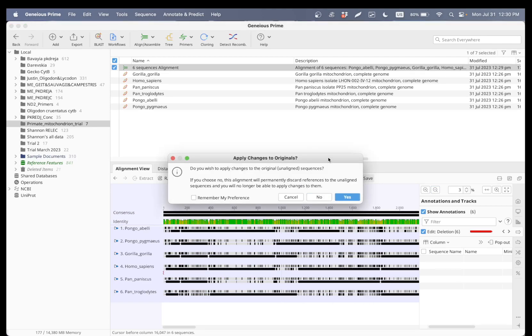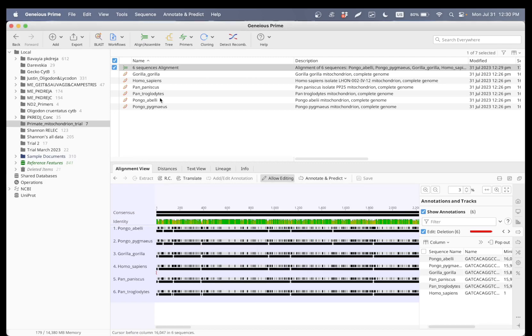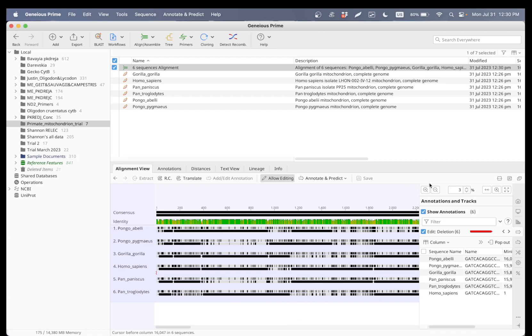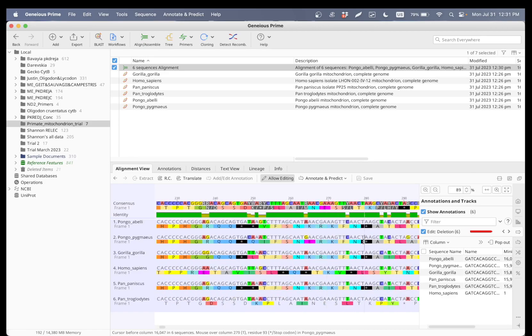Let's go ahead and save. It's going to ask if we want to apply the changes to the original sequences — I'm going to say no, because if you say yes the original sequences are going to be affected as well, and we don't want that. As you can see, we have spots that are green — those are loci that are not variable between sequences. We have yellows, which are slightly variable. And red ones indicate that the site is very variable within these six sequences.